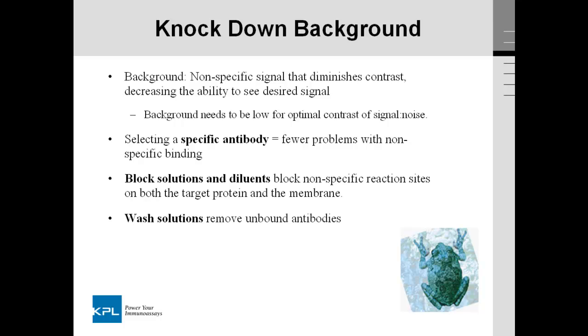Background is an area that many Western blot users struggle with. It may be defined as nonspecific signal that diminishes contrast, thus decreasing the ability to see your desired signal. Background needs to be low for optimal contrast of signal to noise.